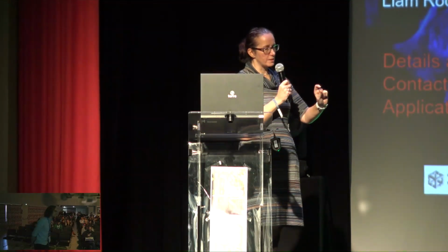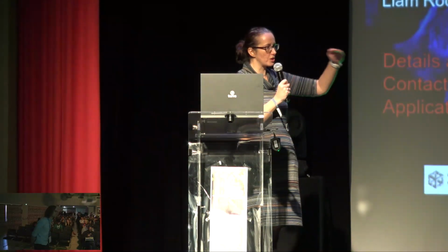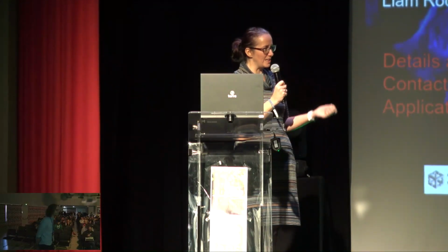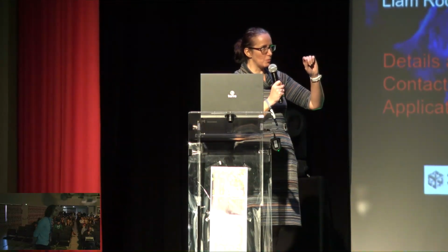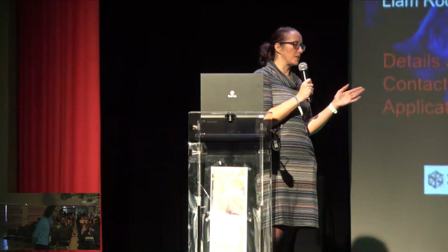The difference here is that because it's over such a wide field of view, we don't really see the curvature that you normally see, this banana shape that you normally get in the Airy beam. So we don't really have that. That's why we don't call it an Airy beam per se.